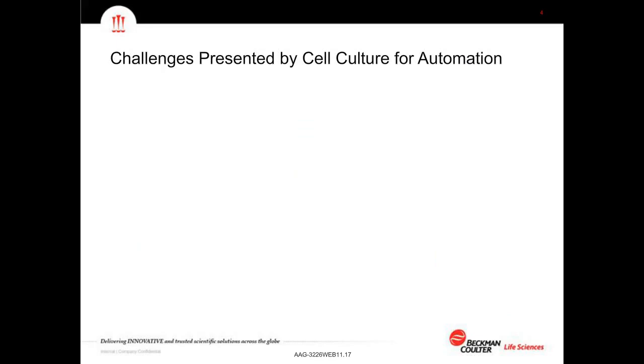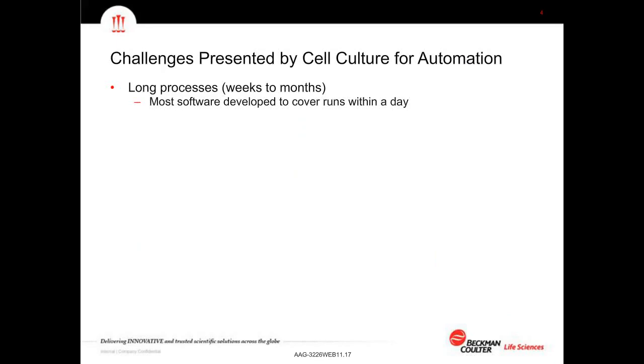So what does cell culture present to us as an automation vendor? Well, the first challenge is that typically these are very long processes. They can be weeks or months. And one immediate challenge for us is that most software that liquid handling or automation vendors supply is really only designed to cover a run within a day. And so what I mean by that is, within a day I may want to do 40 plates worth of media exchange. That would be a day's worth of activity, and a lot of software is designed to cope with that. But the question is, how do we then link together those processes that make that into a full cell culture workflow, from cell seeding right through to some kind of harvesting?